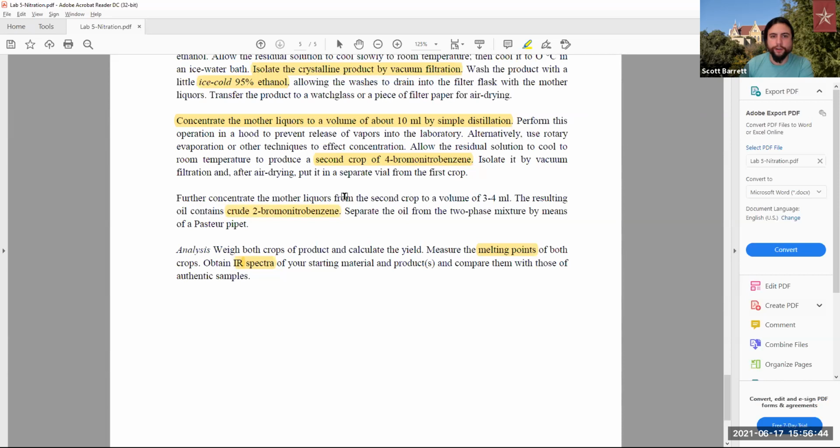This is also a separate situation, because you have your distillation. You can have a crop of 4-bromo nitrobenzene, which would be the para, but then also you can set the mother liquor aside. That would be a crude 2-bromo, the ortho version of the nitrobenzene. So let's watch the video so you can see a good example of that happening. And I do greatly recommend watching it again after our class period if you haven't already, so that you can get clarifications, because there are a lot of in-betweens with regards to whether it is para, ortho, etc. So let me switch over here.